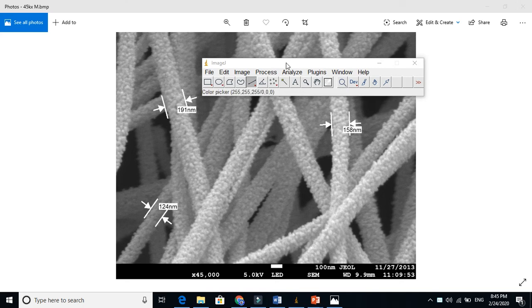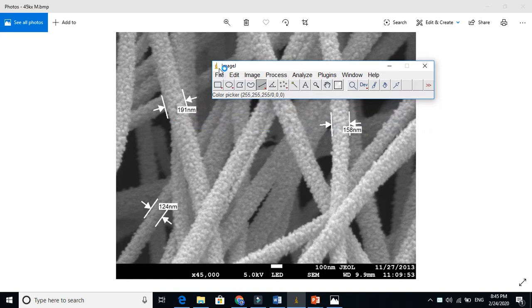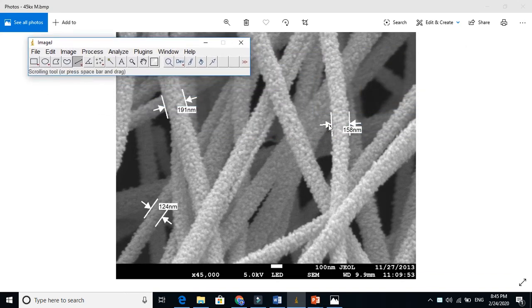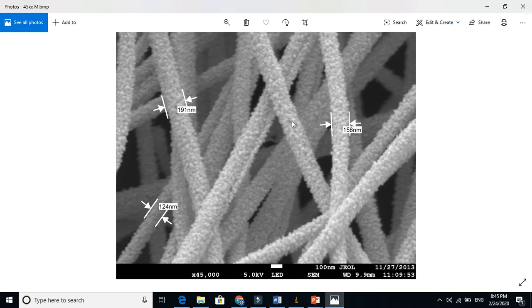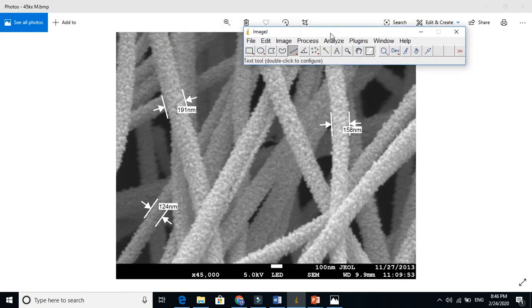In this video I'm going to show you how to find the diameter of a nano fiber using ImageJ software. This software is free and available on Google — just search 'download ImageJ.' It's a versatile software. These diameters we normally find using a SEM machine, but by using the tool inside the field emission electron microscope, we can find the diameter. We will now find it here using ImageJ software, which is very easy.